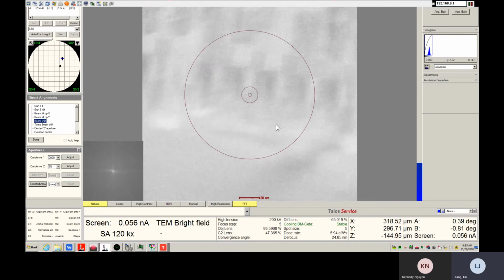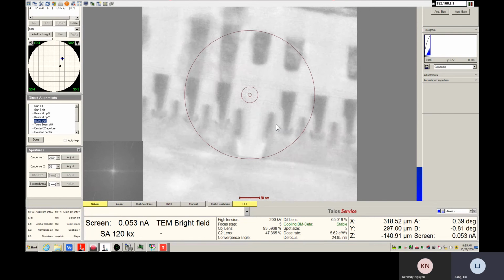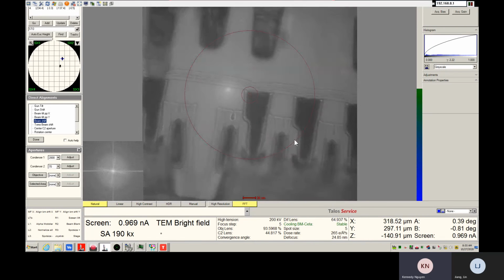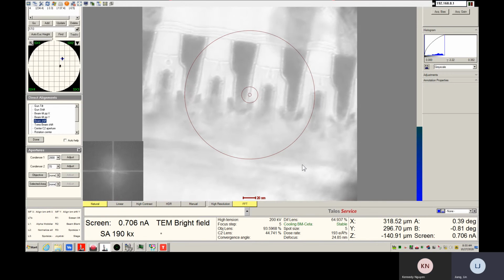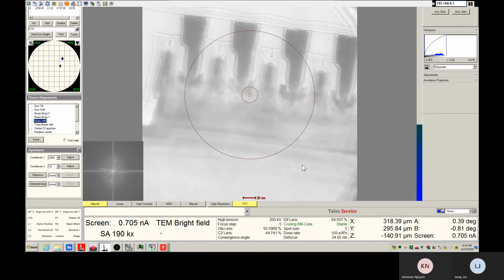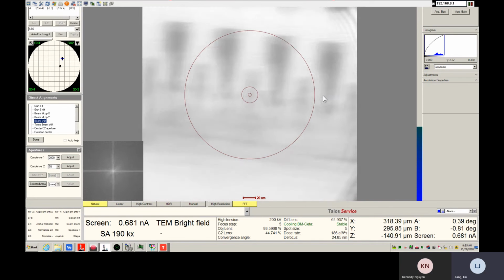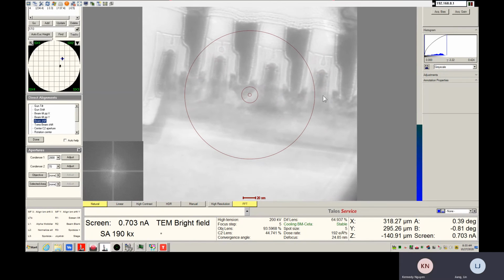Let's go to the focus. Let's find focusing first. Let's search and find a region for you first. Okay, let's do this. You can either do here or here. Let's see if we can find a better one. Okay, this is probably good. Let's do here.